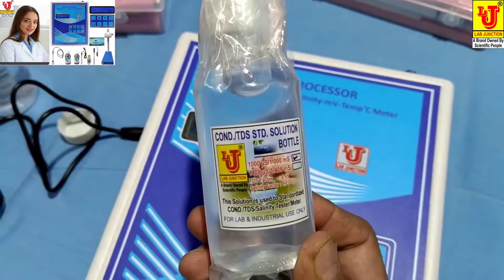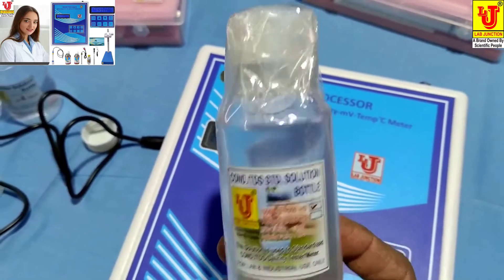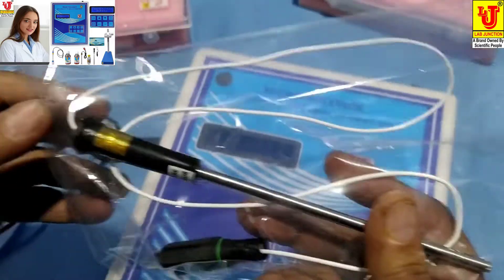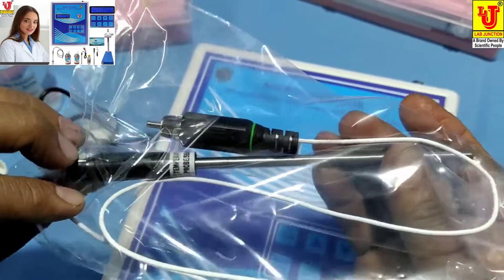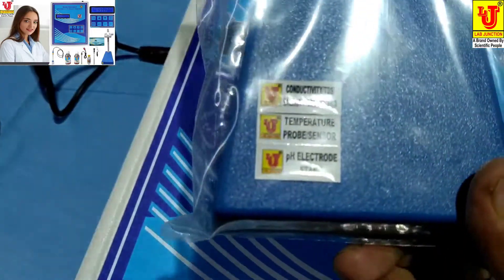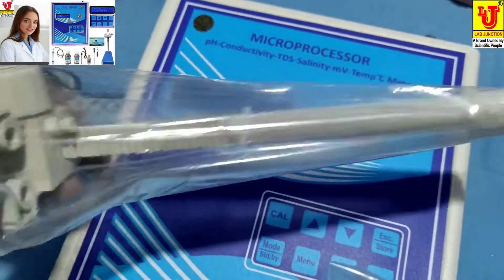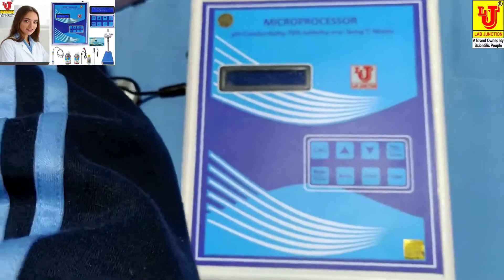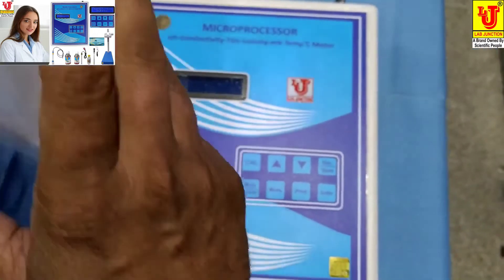A conductivity solution to calibrate conductivity, TDS, and salinity. A temperature sensor. A stand for hanging the pH electrode, conductivity cell, and temperature sensor. And an instruction manual.